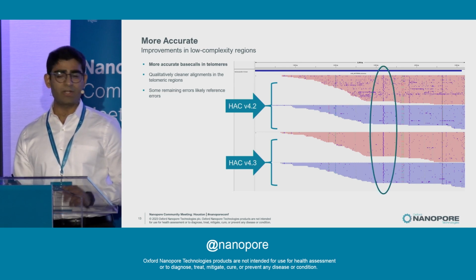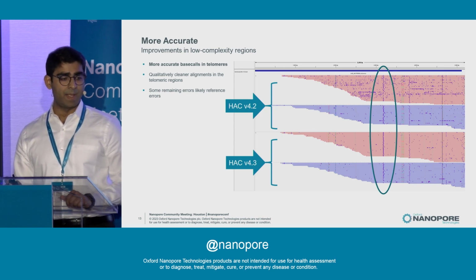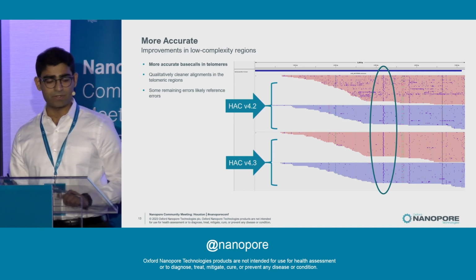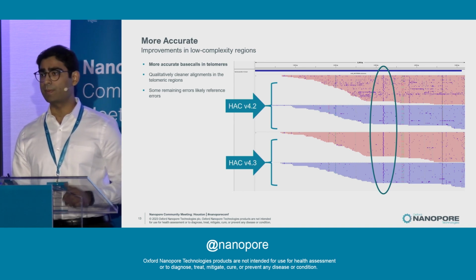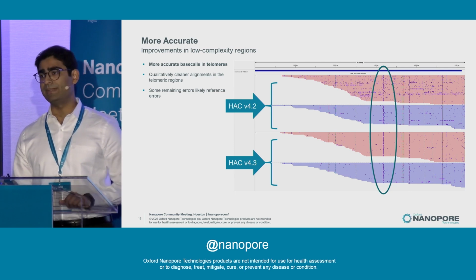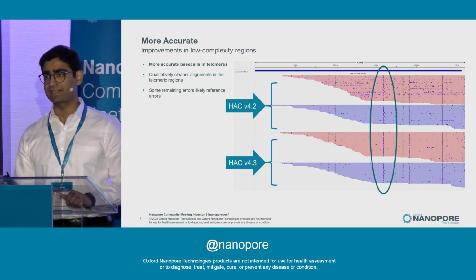There are, however, still a few consistent errors that we see across both of these models, but we suspect that these errors are not actually read errors, but reference errors. We plan to work with the T2T consortium to investigate these more, and if they do turn out to be reference errors, hopefully we can integrate those back into the reference in the next version.